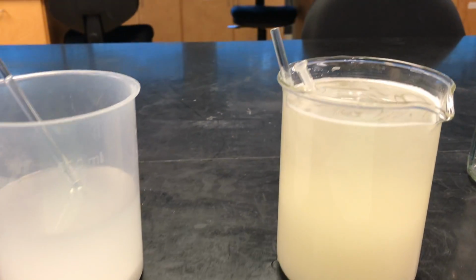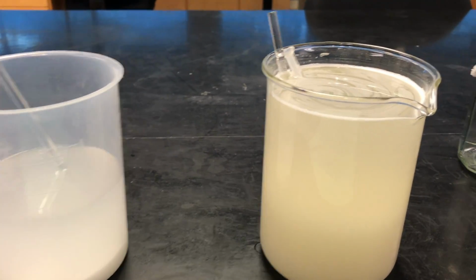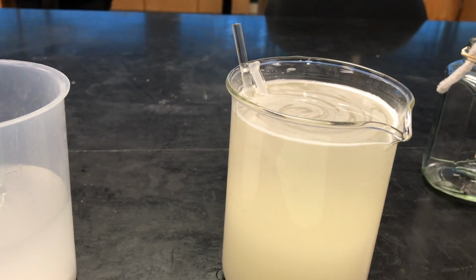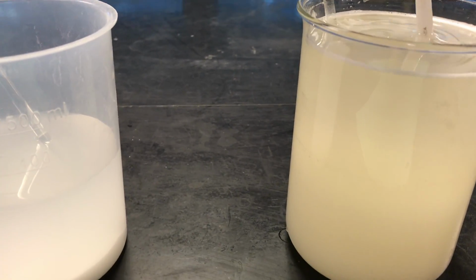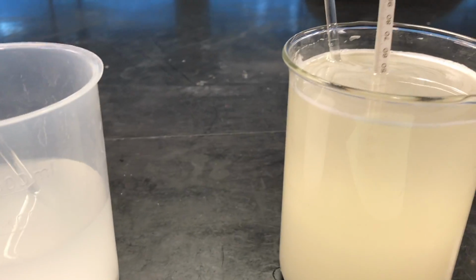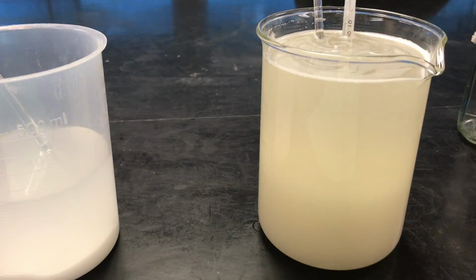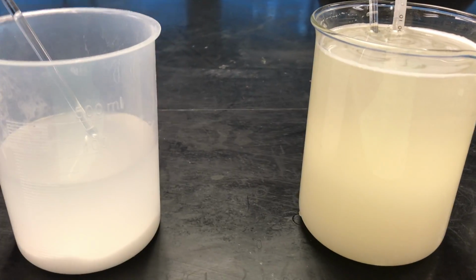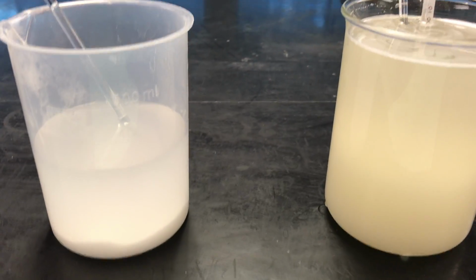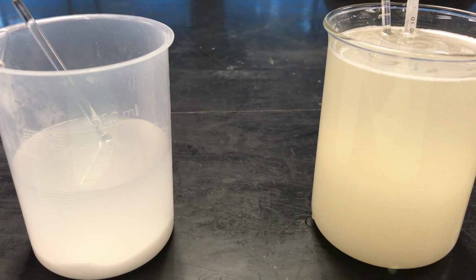I have a glass beaker, but you can see it is the same size as your lab beaker. So you might want a bigger bowl or something to mix that in, but this is my saturated solution of the sugar solution. So again, I took the temperature of that and I could record the observations. You only need to do 1 of the different solutes, but just for demonstration purposes, I've got the borax and the sugar going here. So do record your observations for part 1.